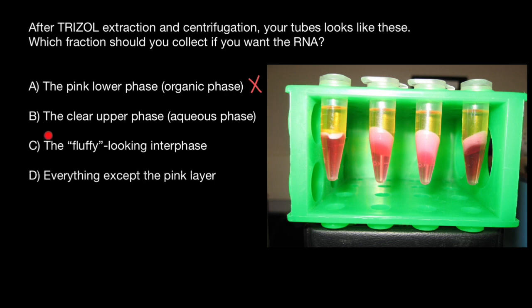Then, for example, variant C, the fluffy looking interphase, which we can find here in each sample. This phase contains DNA. So also wrong choice for us.